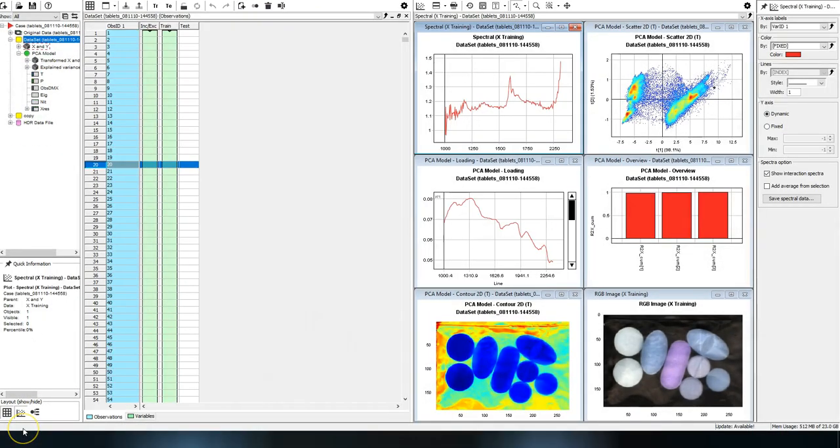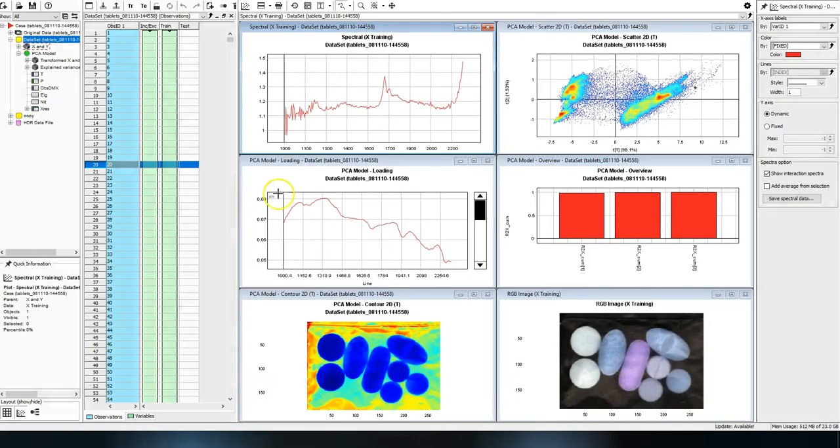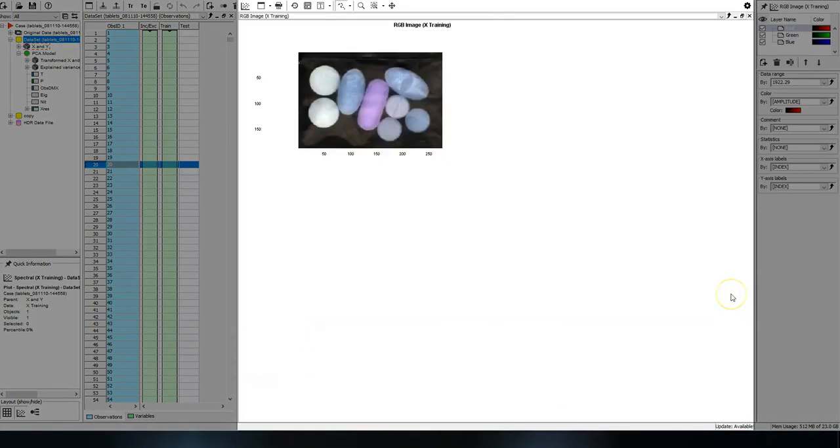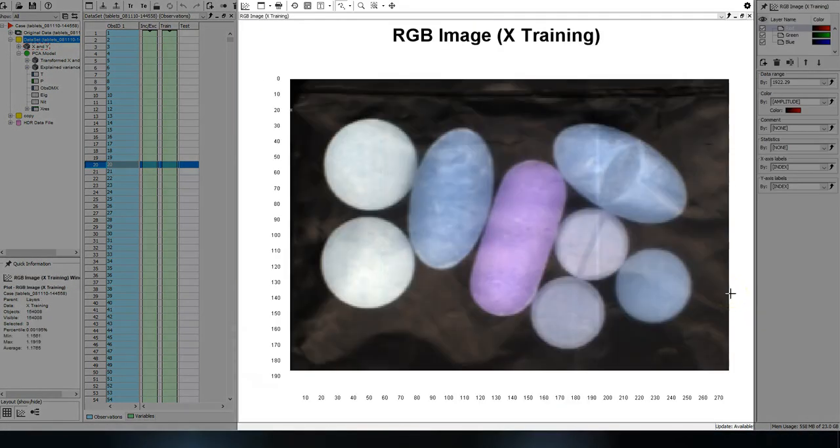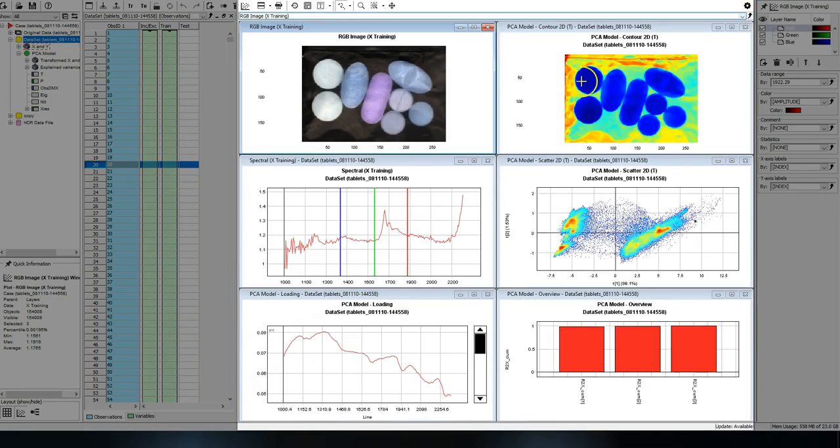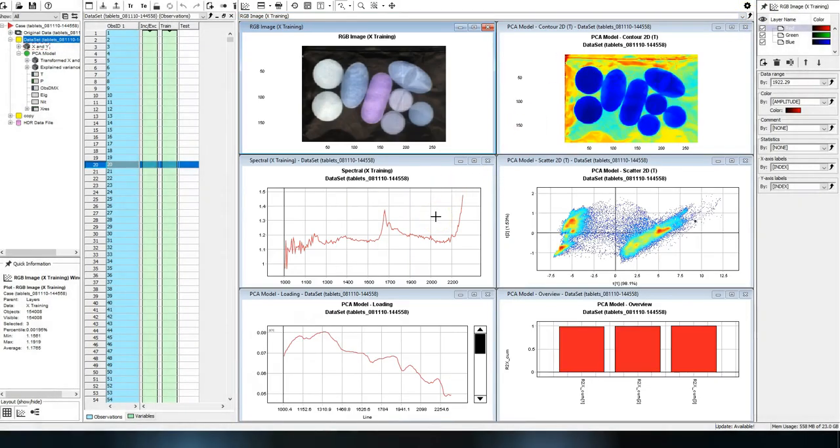The plot area is where you can show information in the form of images and plots. In this case I have a pseudo RGB image representation of the image file I imported, along with the spectral plot and the default plots generated for a PCA model.